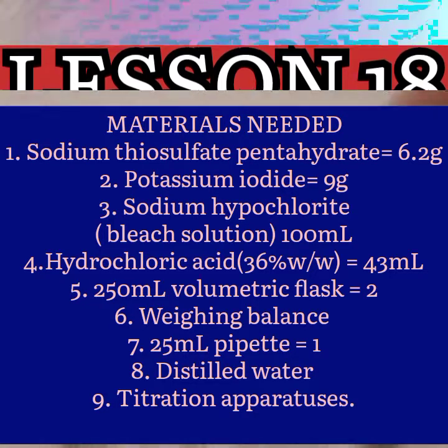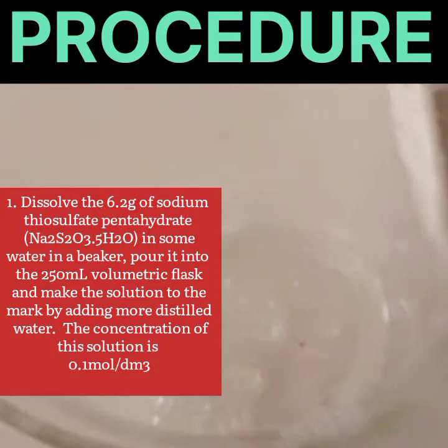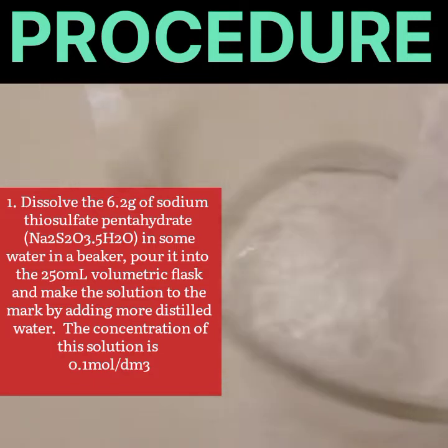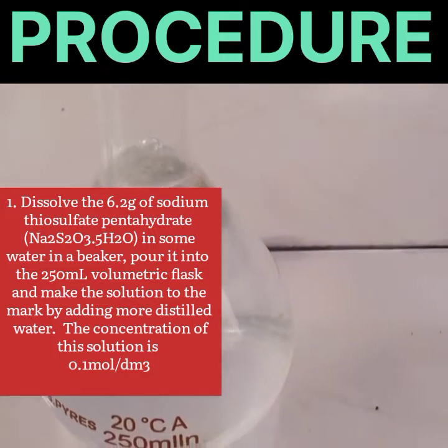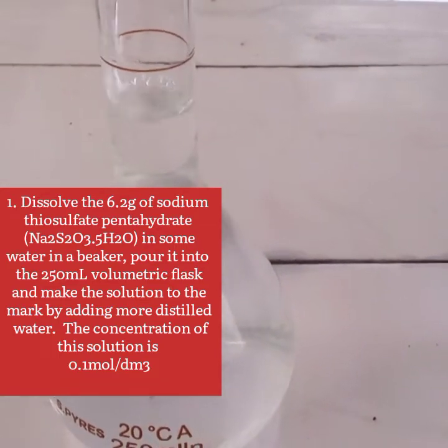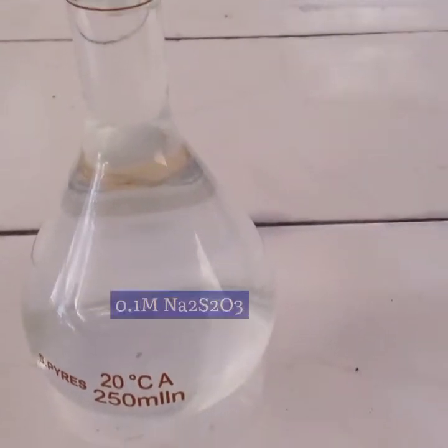Now let's see the procedure. The first thing to do is dissolve the 6.2 grams of sodium thiosulfate pentahydrate in some distilled water in a beaker, then pour it into the 250 ml volumetric flask and make the solution up to the mark by adding more distilled water.